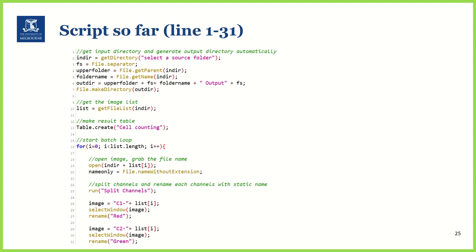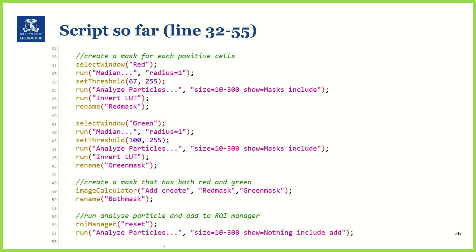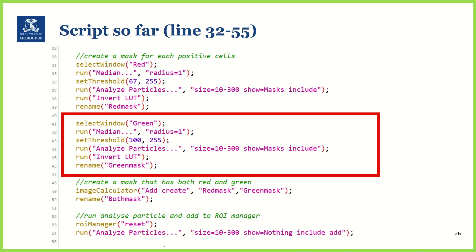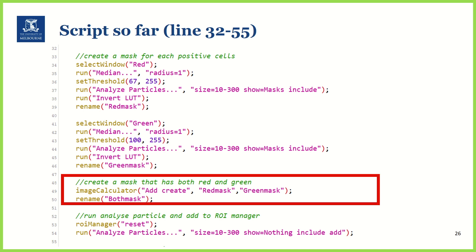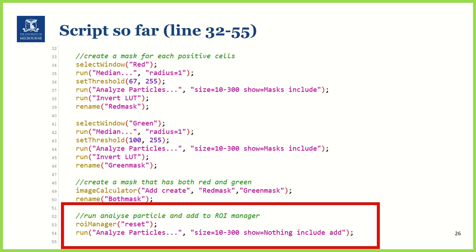So this is what we have done so far. I have already gone through lines 1 to 31. From line 32, we made a red mask and green mask using median filter, set threshold, and Analyze Particles with the mask option. Then we created the 'both mask' using Image Calculator. And then we cleared the ROI manager before adding every cell to the ROI manager.